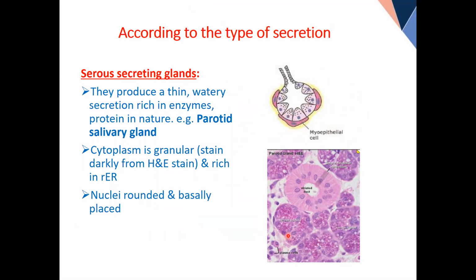Can you see these cells? Yes or no? Now, what is this color here? Pink or purple? And what is this color? No, this one. This is not pink, it is purple. After that, I will stop and take questions. Many of you are asking this question.